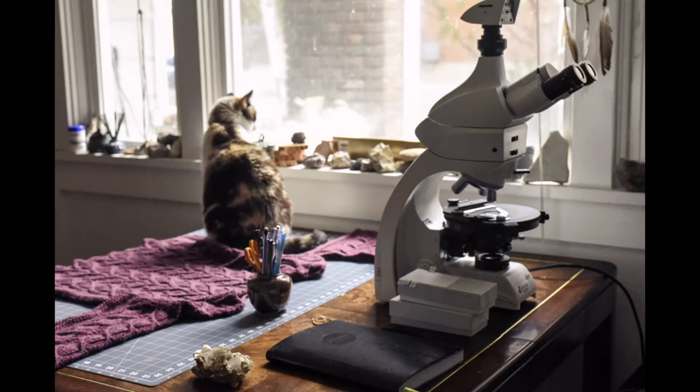One of the tools geologists use is a petrographic microscope. We use the microscope to look at small-scale structures within a rock, and we also use it to determine mineralogy.